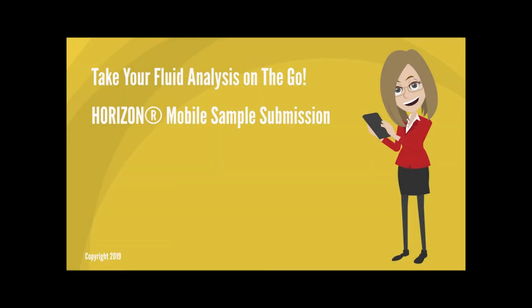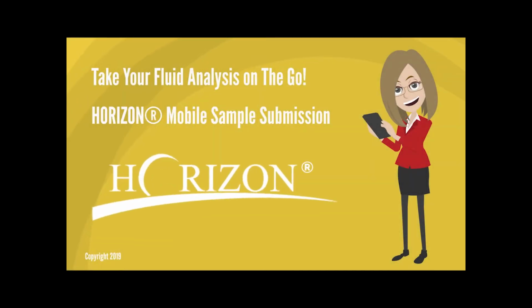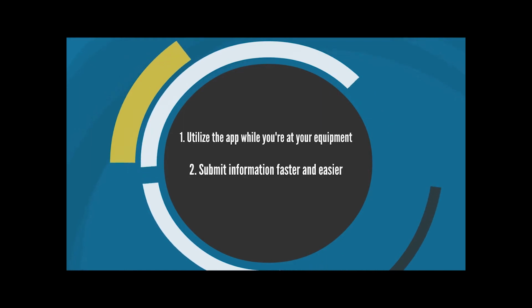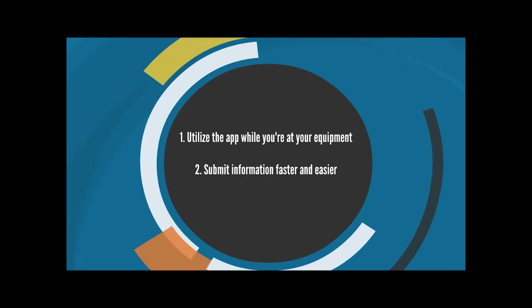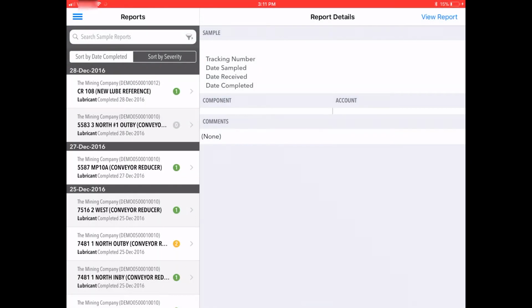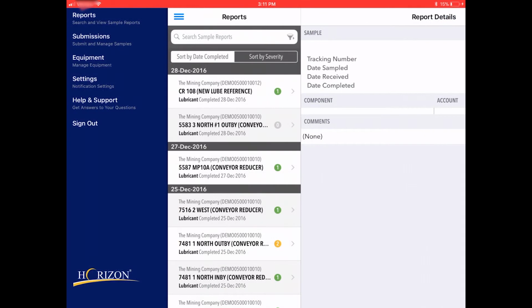In this video, we will show you how to submit your fluid analysis sample on your mobile device through the Horizon mobile app. Submitting and editing sample information via the Horizon mobile app is convenient, quick, and easy, and eliminates handwritten paperwork errors.